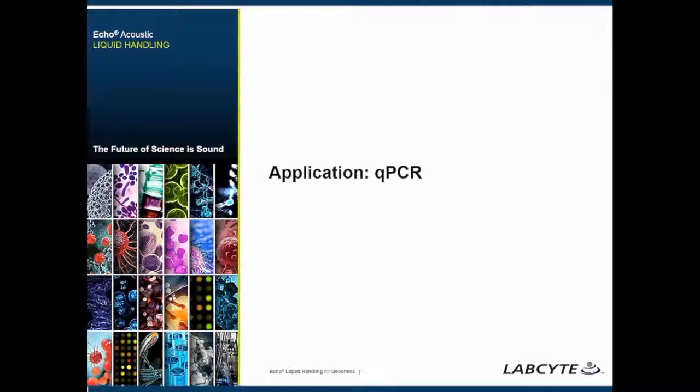To recap before moving on, I spent some time describing the PI3K pathway and its utility and value as a scaffold for our work and some of the tools that will be used, specifically the MCF7 and PC3 cells for this webinar. The aim is to make the experiments more relatable to you and your research goals. Your time is valuable, and my goal is not to simply describe techniques to you. Instead, I want to provide true applications of acoustic liquid handling. Now, that said, let's continue.